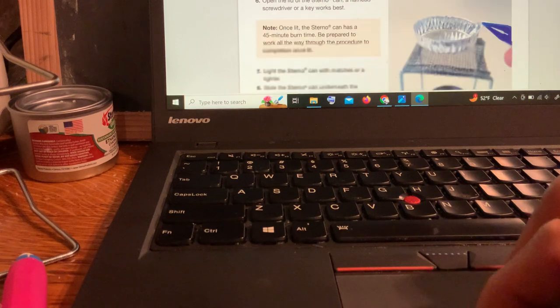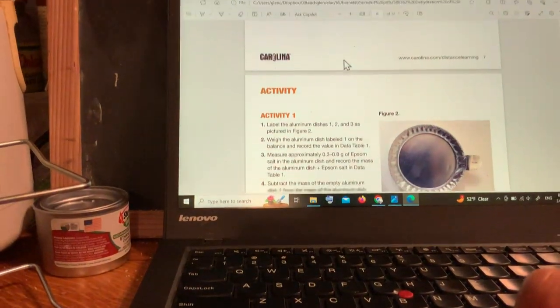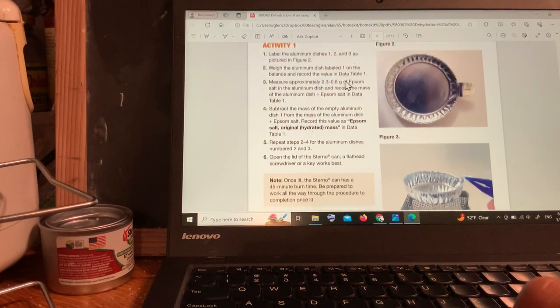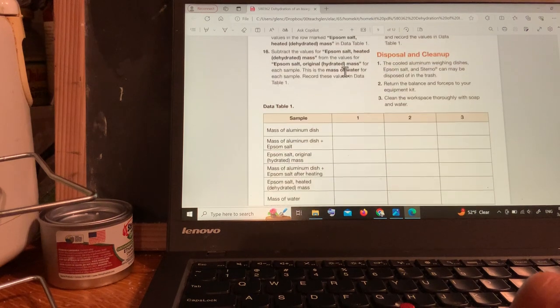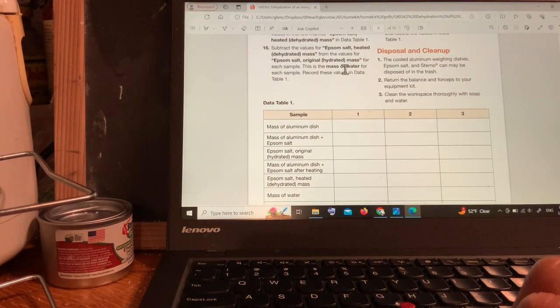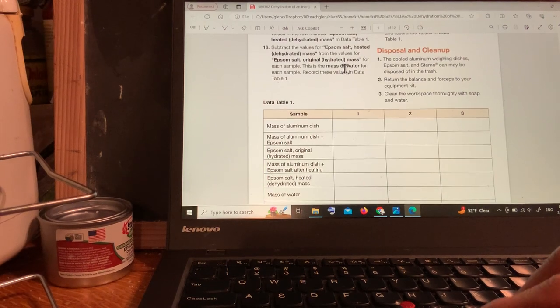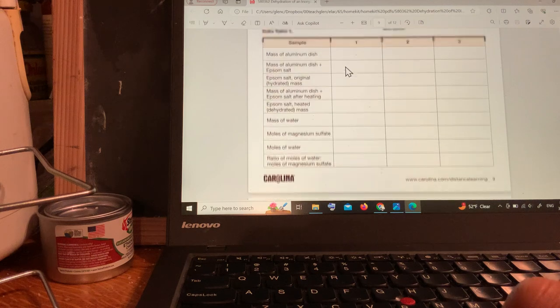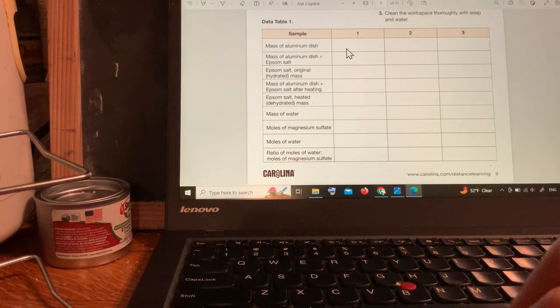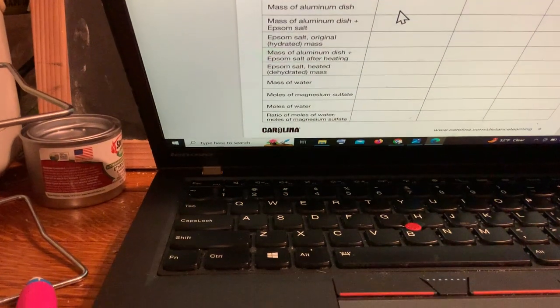Now, if you want to follow the instructions exactly in the PDF, that's fine. But in this video, I'm going to show you an alternative that might get you better results. I'm going to put the data table right here and show you how you might get some slightly better results.